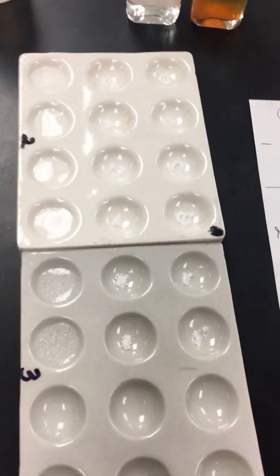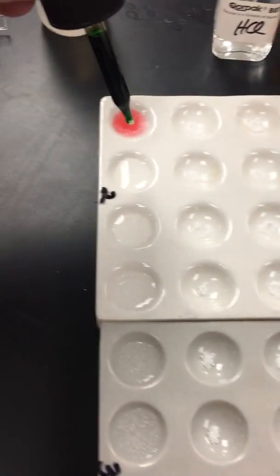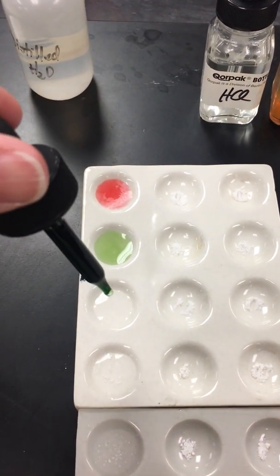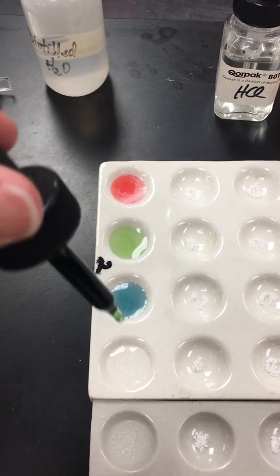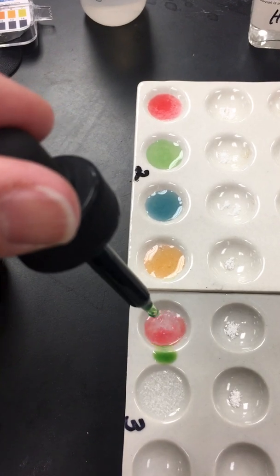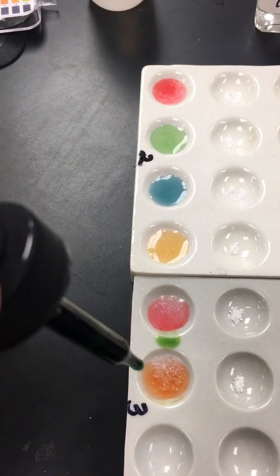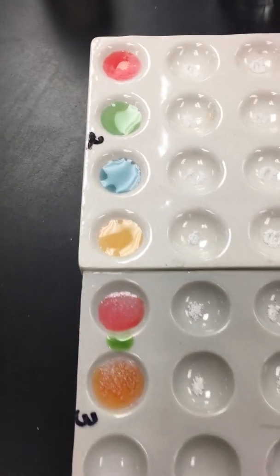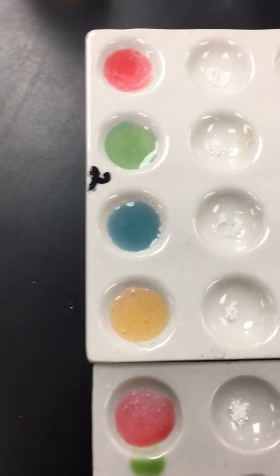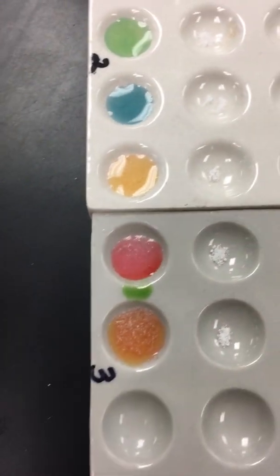Sorry. And to that same column, we're going to add a drop. Oops, sorry, that one turned nice and bright pink and bubbled a little bit. And that one turned green. That one turned blue. That one turned sort of an orange. That one's kind of a pink. And that's kind of a darker orange. So here are our colors really well: aspirin, Alka-Seltzer, sodium bicarbonate, acetaminophen, Excedrin, and ibuprofen.